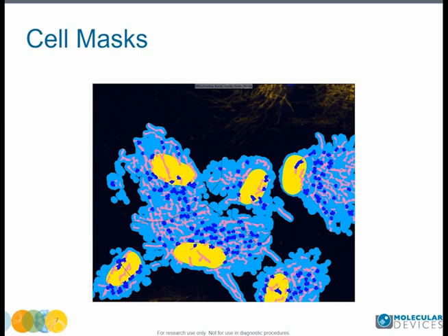But in the beginning of this talk, we mentioned a single mask that we could generate and measure intensity variance as a stand-in texture measurement that we could use if we didn't need volumes or other high content numbers. To get that measurement, we would need the second, more accurate cell mask. And so for this presentation, I will quickly walk you through the generation of this more complete mask.